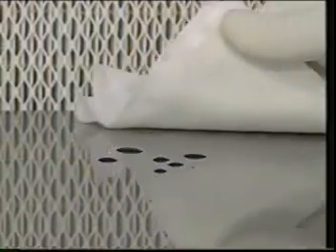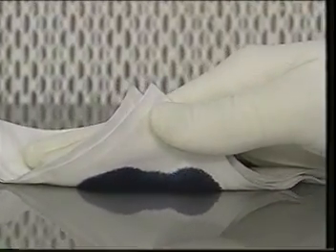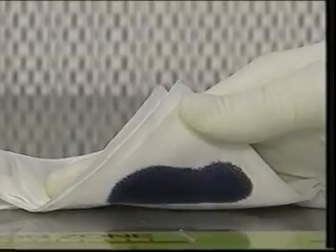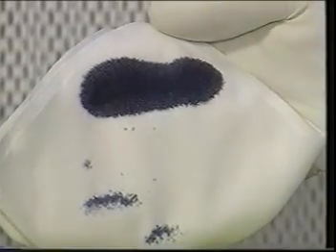This modest-looking piece of material represents the culmination of extensive research into contamination control. When brought into direct contact with the cleanroom surface, the fibers of this wiper act as micro squeegees, providing the force necessary to dislodge contaminants so that they can be drawn into and trapped in the body of the wiper.